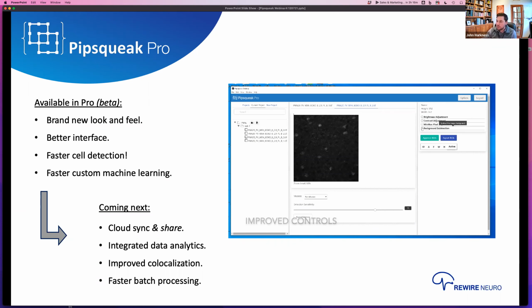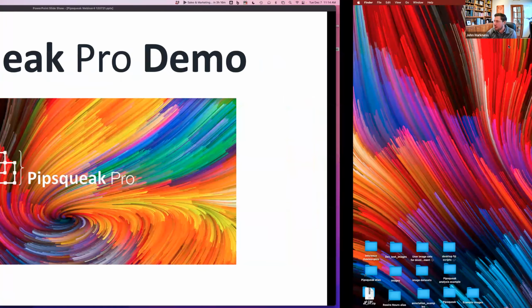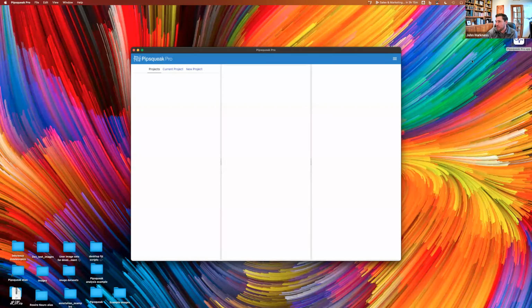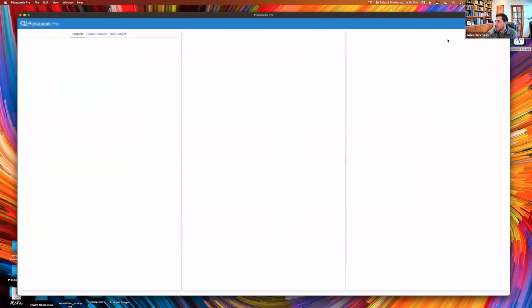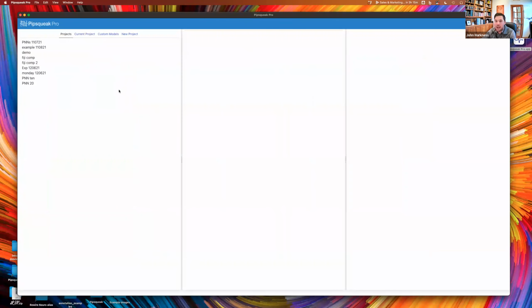So today in Pipsqueak, what we've got available is single label analysis, and I'm going to show you how that works here. So we're going to head over. I've got my fancy wallpaper desktop, and so the first thing you'll notice is when I open Pipsqueak, all I have to do is execute the Pipsqueak icon. So that's really nice, you've got this really clean interface here. And when I log in, I'm able to log in exactly the same way that I have been in Fiji. So this is even your same login here.